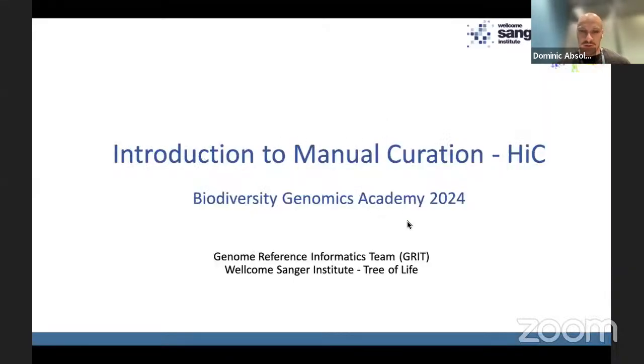I take it everyone can see the slides okay. Cool, yeah, so welcome to our workshop on manual curation, predominantly using Hi-C. We ran this last year, so if you're here for a refresher, welcome back. And if you're new, just welcome. The session's being run by, as you can see, the Genome Reference Informatics team here at the Sanger Institute. We delightfully call ourselves GRIT for short.